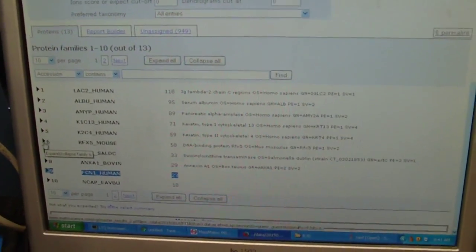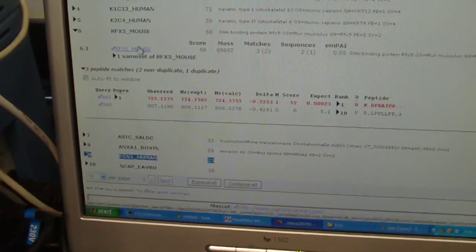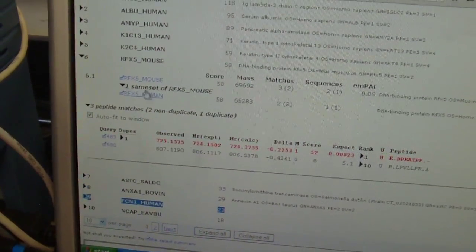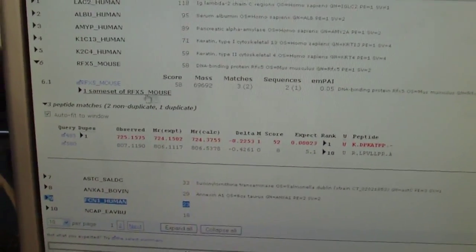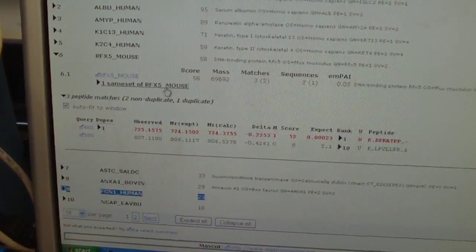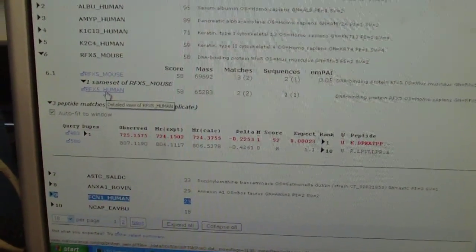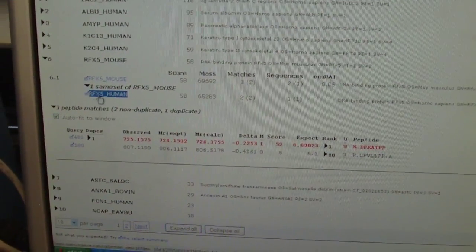And to check that out, you can click on this arrow, and when you click on that arrow, it'll open up anything else below. And right here, it'll say different same sets that you have. And if there's a same set here, it'll have all the same sets listed. And if there's one that says human, then you can get it. This one didn't have a same set for human. It did? So when you clicked on it, no? Right here? Oh yeah, you're right. Sorry, there it is. There's the same set right there, and that's the human one. So that's why it came up with it. Does that make sense? So that would be one you'd want to include there as well.